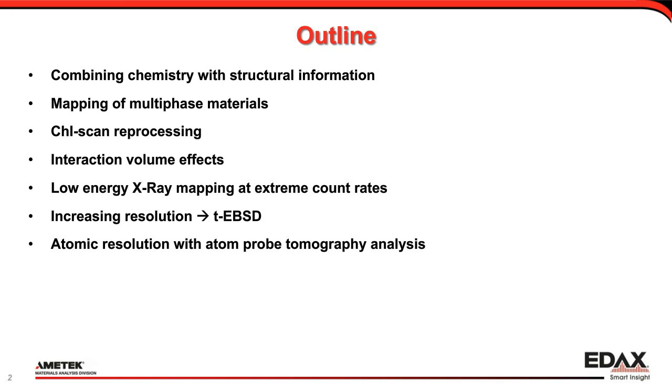When we then zoom into a higher resolution analysis, we can go away from doing EBSD on bulk samples to use TEM foils for transmission EBSD. And when even higher resolution is required, EBSD can be paired with atom probe tomography, which will be presented by Katie Rice.